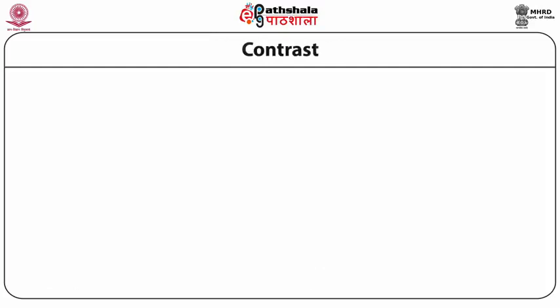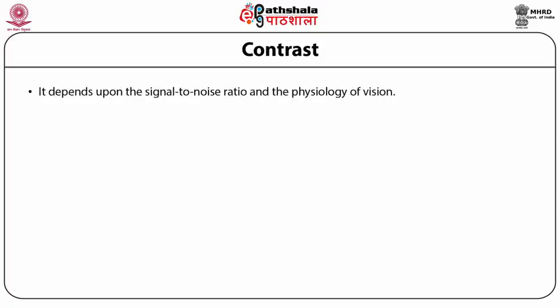Next is the contrast. The contrast depends upon the signal to noise ratio and the physiology of vision.